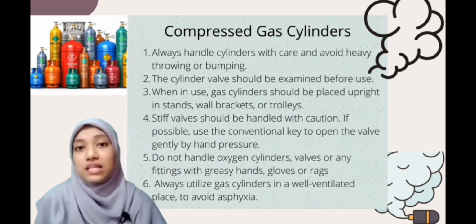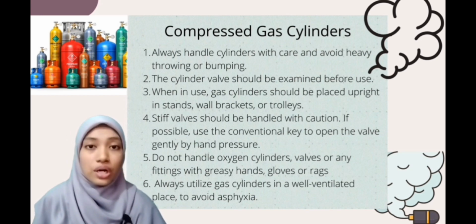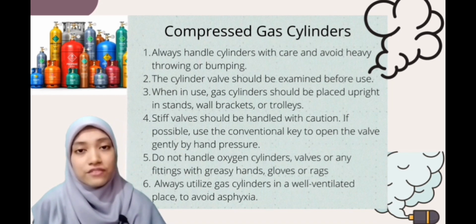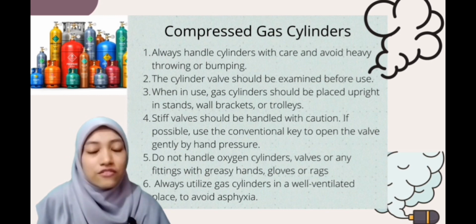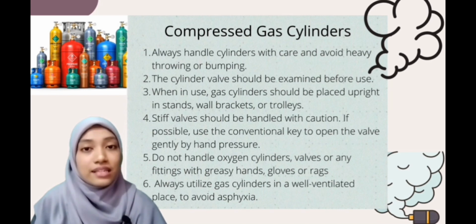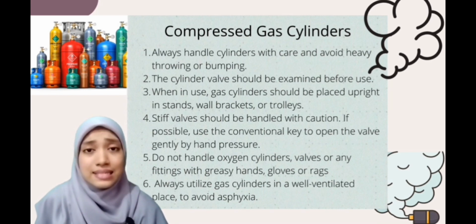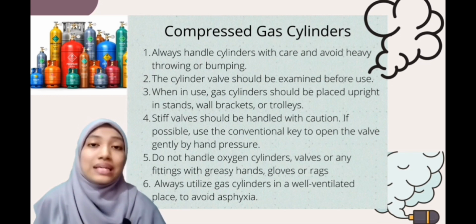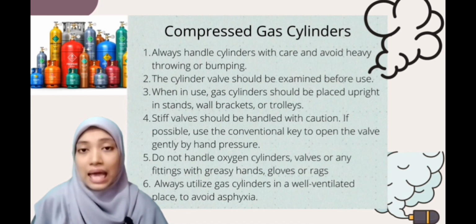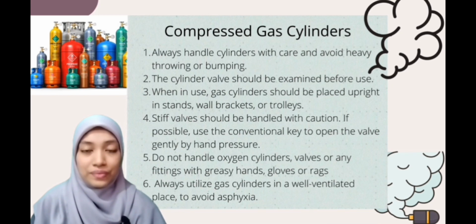The first step is always handle cylinders with care and avoid heavy throwing or bumping. And if the gas cylinder is discovered to be physically damaged, notify the supplier immediately. Next, the cylinder valve should be examined before use. This step is necessary so that we can determine whether the valve is safe to use or not, and most importantly, the valve can be opened easily.